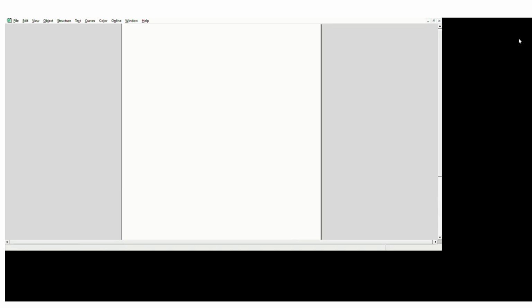Hi, today we will discuss NMR spectra of paracetamol. I hope you have some idea about NMR spectra. As this is part 1, today I will tell you the basic things about the NMR, what the objective of it is. Before that, just write down the aim we do today.